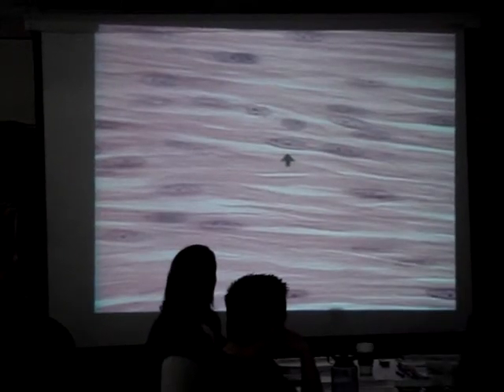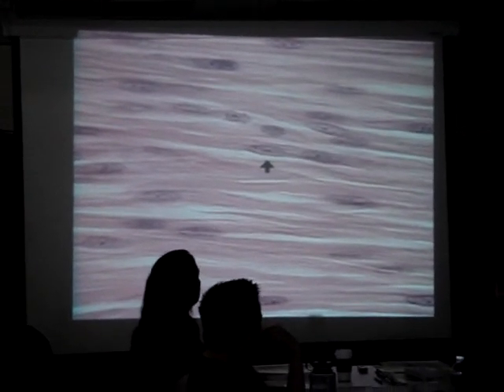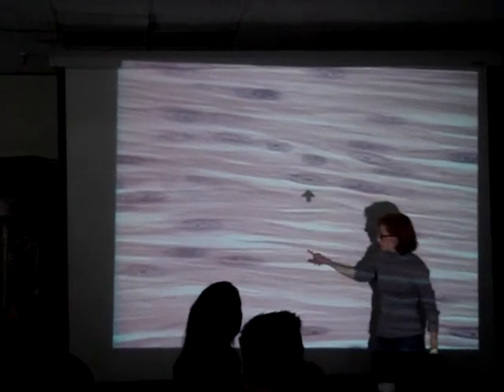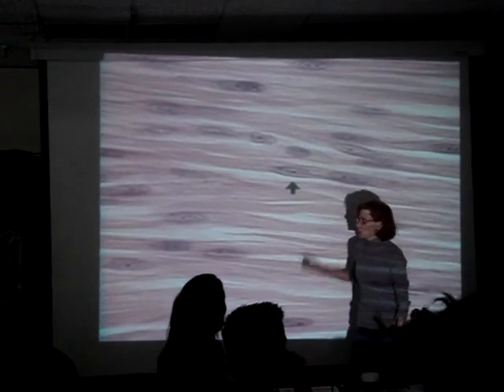Okay, what is this tissue? Smooth muscle. This is what it will look like in the slides, where you see kind of a sheet of smooth muscle cells that looks a lot like dense, regular connective tissue. Now here in this picture, you can kind of see the shape of some of these cells. This is probably not going to be the way it will look usually in slides because you can't always see this, but notice you see the shape of the cell here, which gives you a little clue. These cells come to a point, and no striations. That is how you know it is smooth.